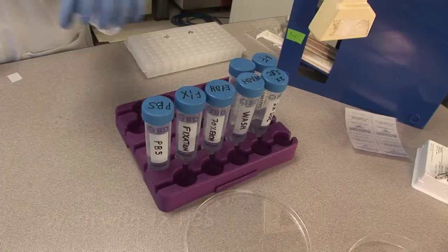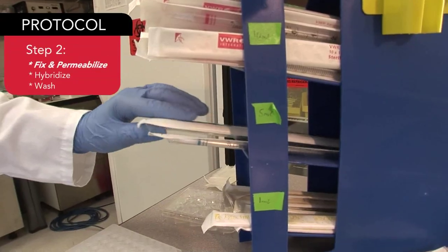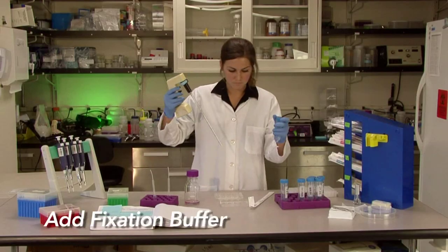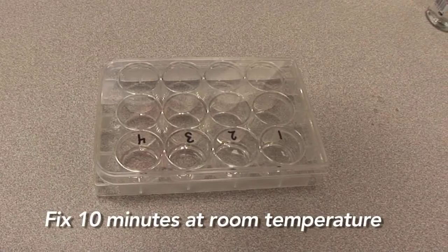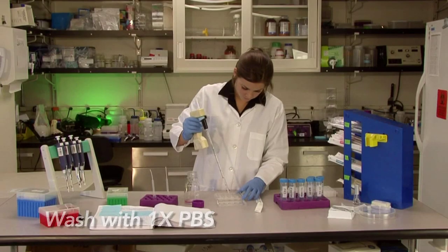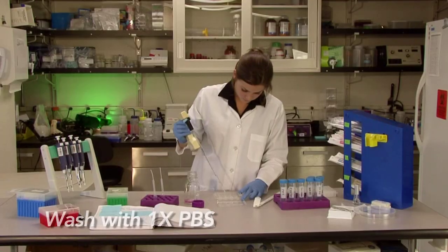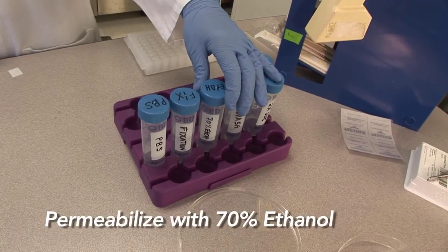So after taking out your cells from the incubator, the media is aspirated and the cells are washed one time with PBS. So after the single wash in PBS, the cells are placed in fixation buffer, which is 3.7% paraformaldehyde in 1x PBS. The cells are fixed for 10 minutes at room temperature. So after the fixation step, the cells are now washed 2 times in 1x PBS. After the final wash with PBS, the cells are now permeabilized with 70% ethanol.